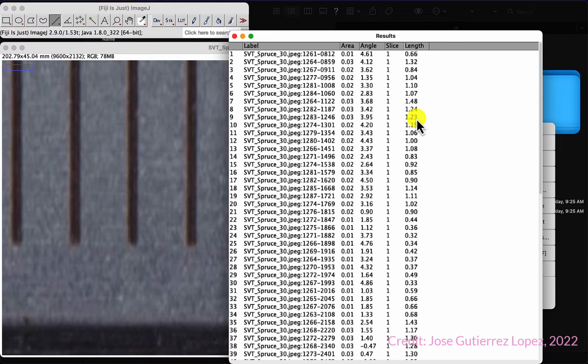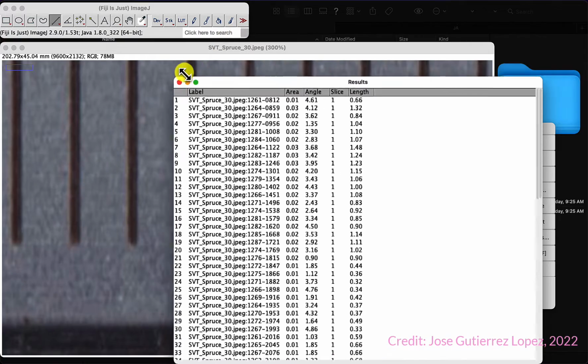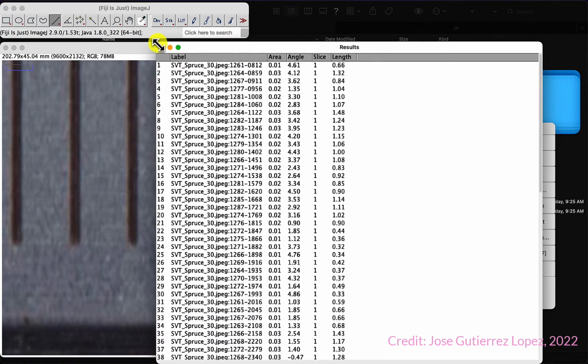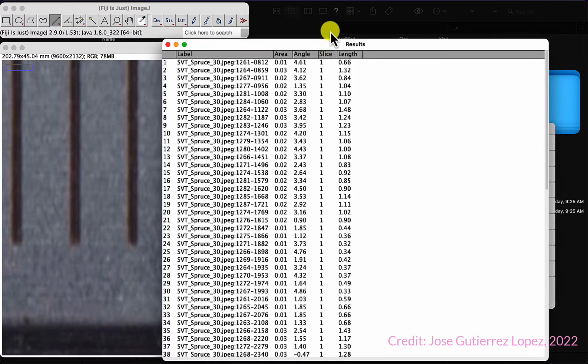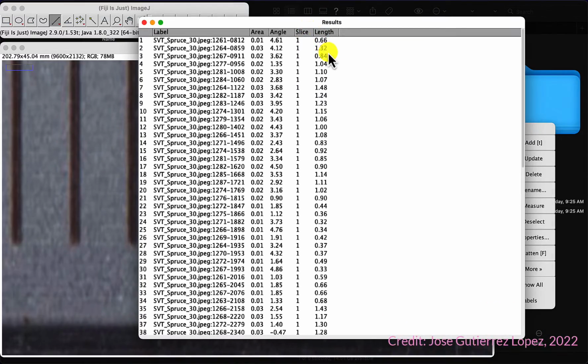This might be actually better in terms of resolution. I didn't think of that. I need to think about this very carefully, because maybe it's best to enter the scale in 150 millimeters, instead of centimeters, because I personally like better to see this additional decimal point, because in centimeters we had 2, but then I don't know how precise they are.